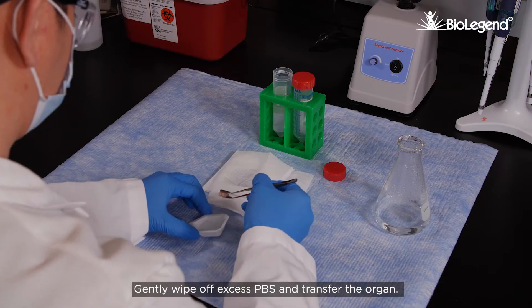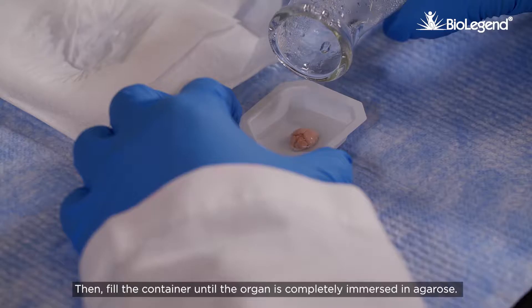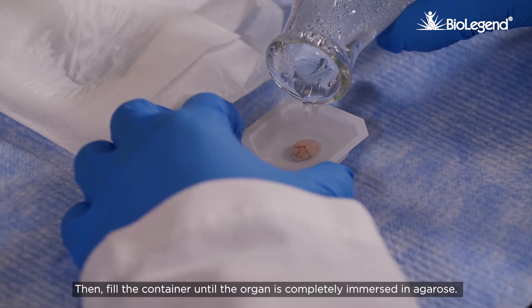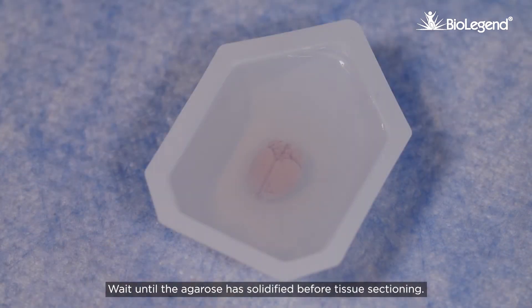Gently wipe off excess PBS and transfer the organ. Fill the container until the organ is completely immersed in agarose. Wait until the agarose has solidified before tissue sectioning.